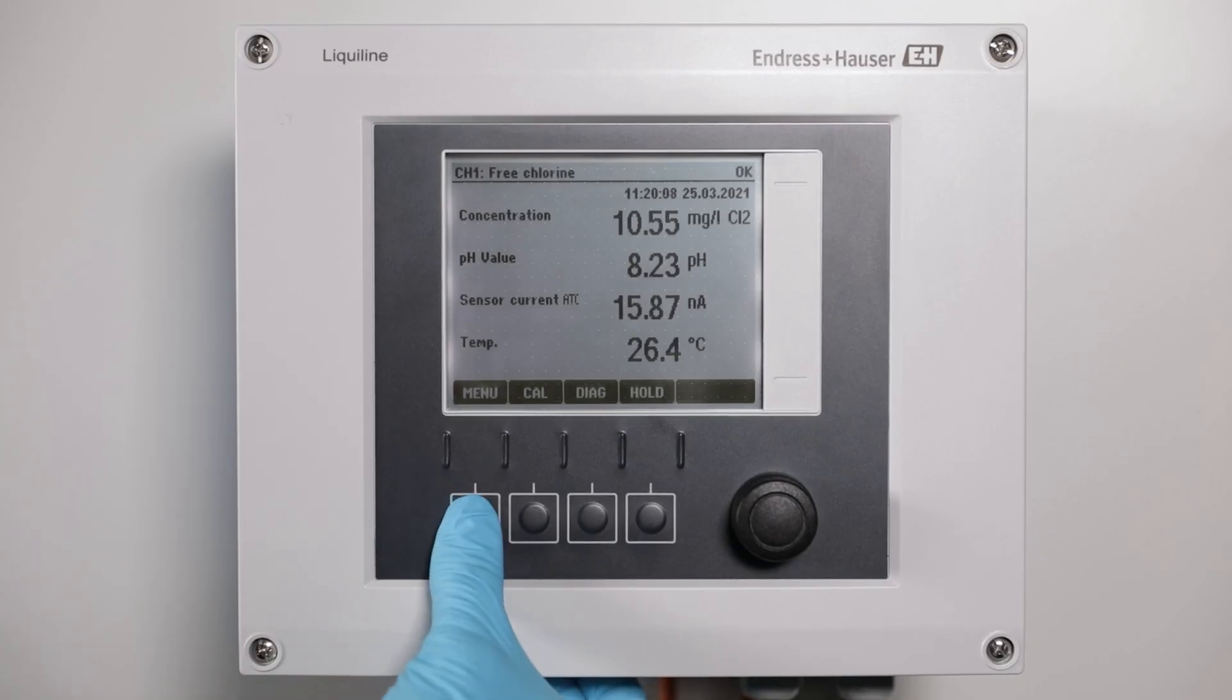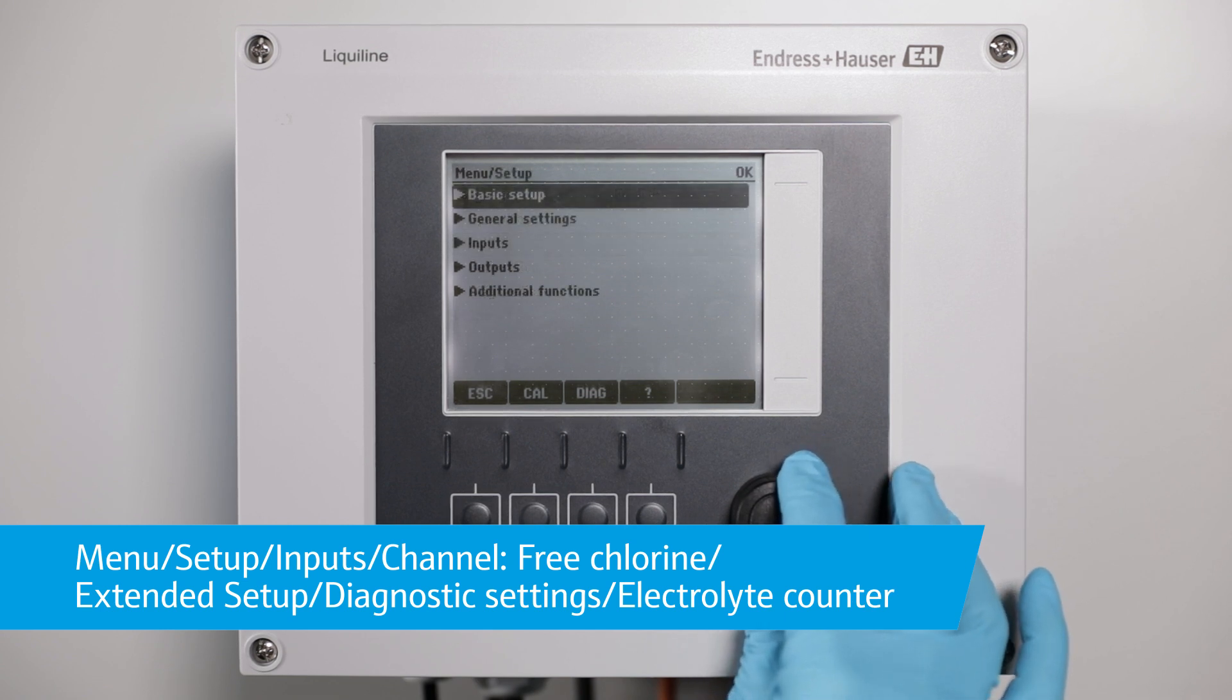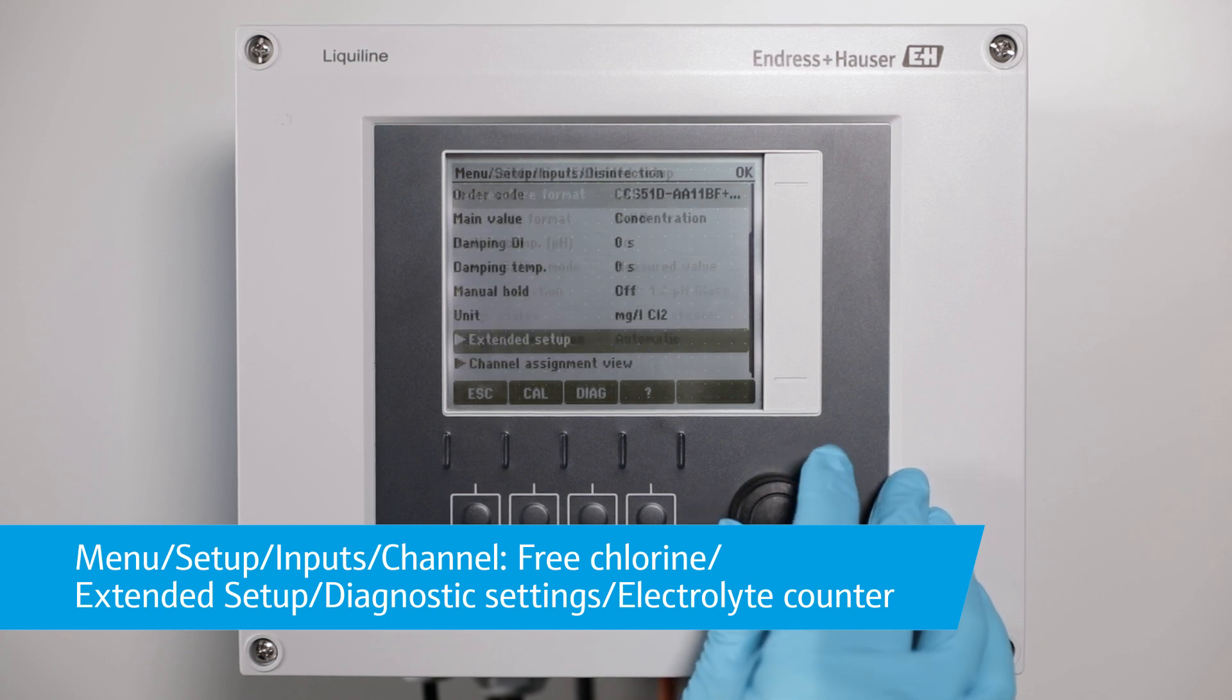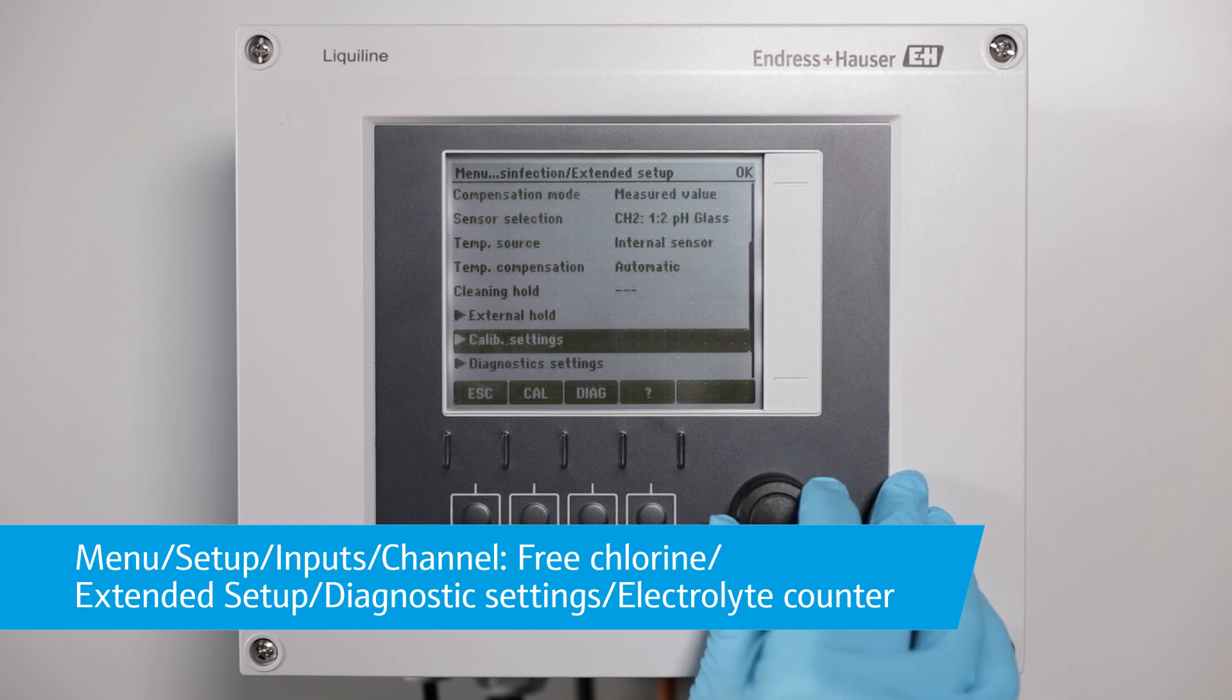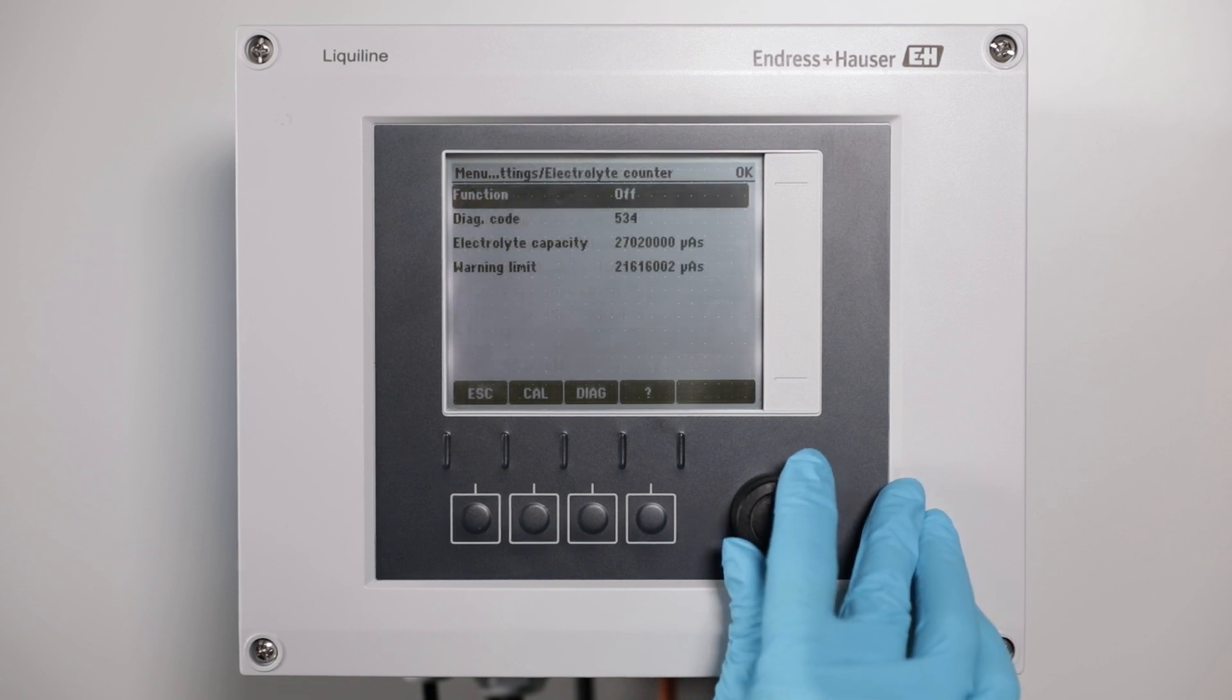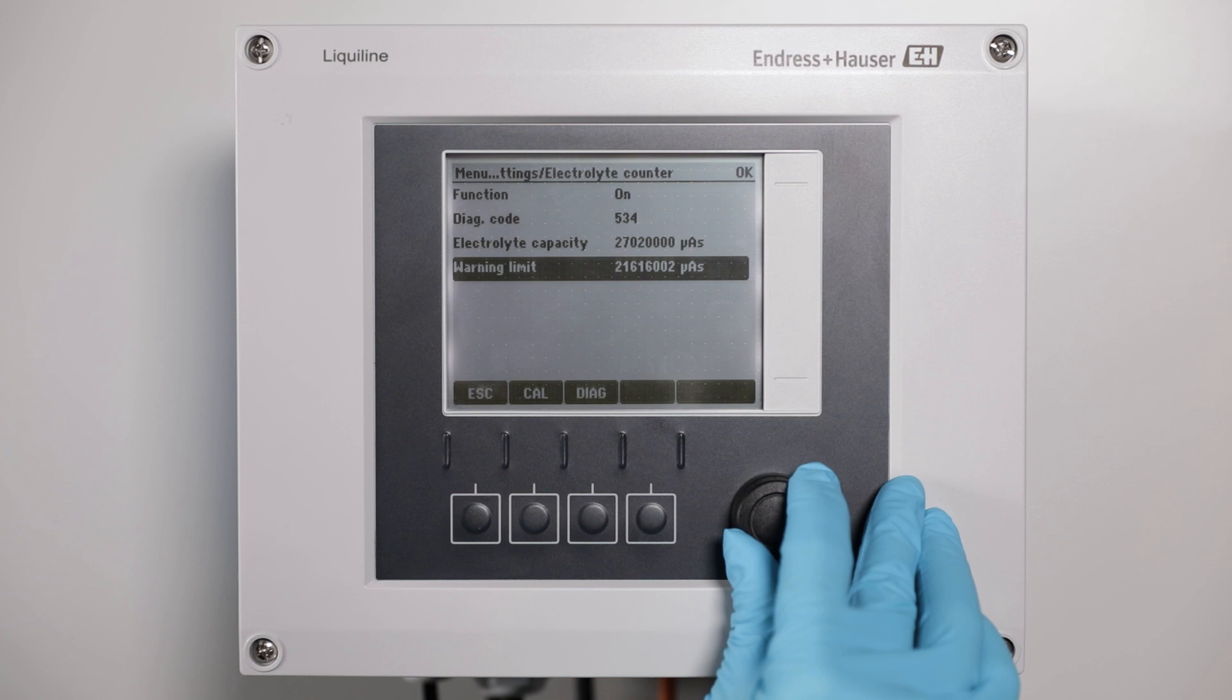To enable the electrolyte counter, please go to Menu Setup Inputs, choose the free chlorine channel and go to Extended Setup and enter the diagnostic settings. Scroll down to Electrolyte Counter. Activate its function and set the required warning limit according to your individual predictive maintenance planning.